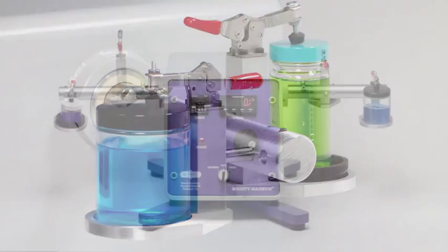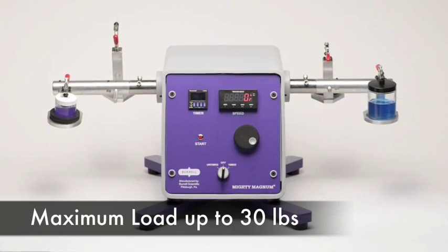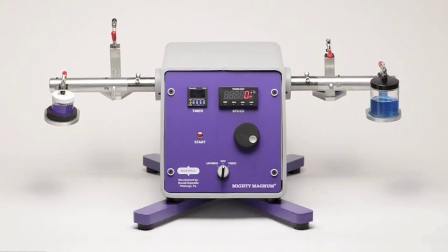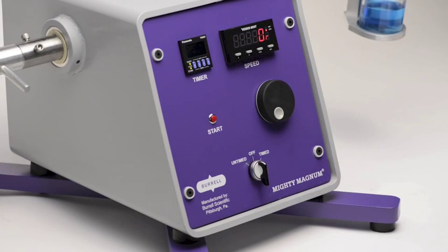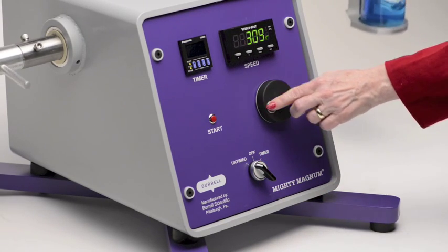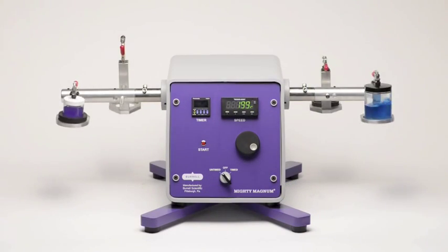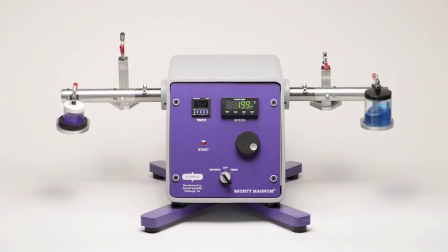The Magnum shaker is capable of handling heavier loads up to 30 pounds. Set the shaker for timed or untimed operation, and turn the knob to control speed from 0 to 600 plus oscillations per minute. The shaker is set at a 10-degree arc movement.